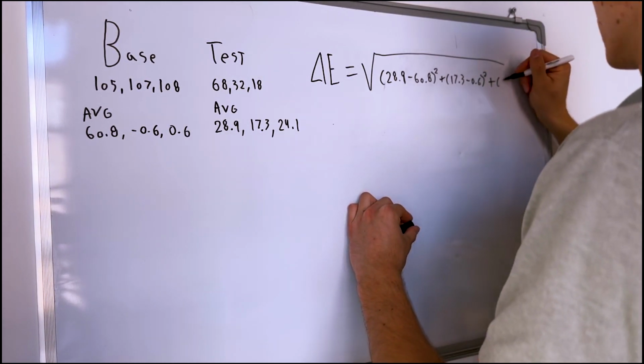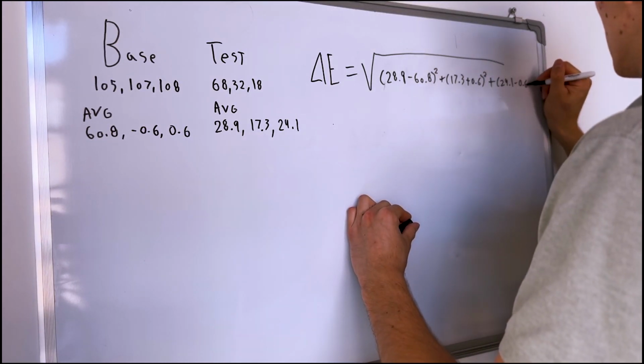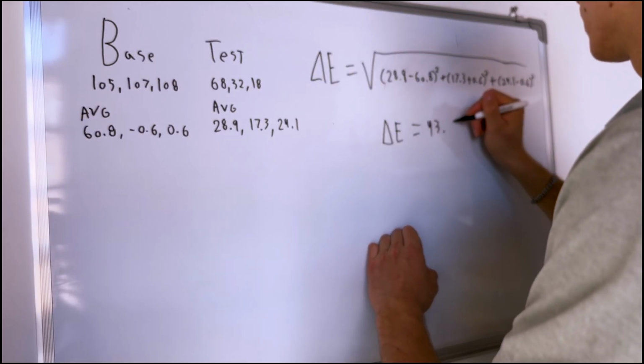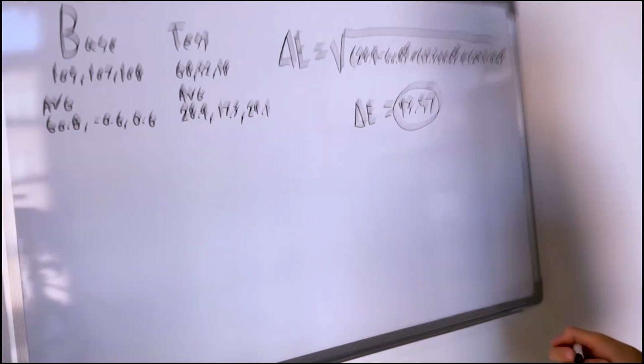The higher the number is, the bigger discrepancy there is between the baseline and the testing piece of glassware. And the lower the number is, the closer in color the testing piece is to the baseline. So a higher number will equate to a potentially dirtier piece of glassware, and a lower number will mean that the glassware is cleaner and closer to the baseline.